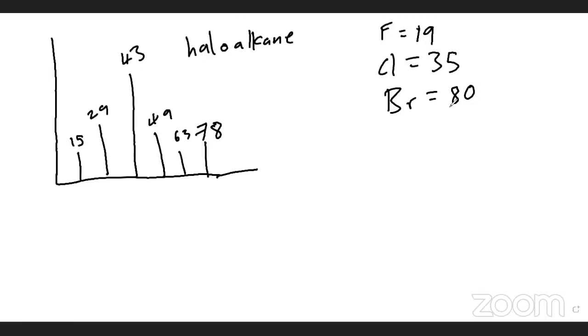Do you know which one is the most stable? The tallest peak is the most stable one. So the person asking from the channel, the tallest one, that is the most stable peak. When you get a haloalkane and you want to figure out its structure, this is what you will do.